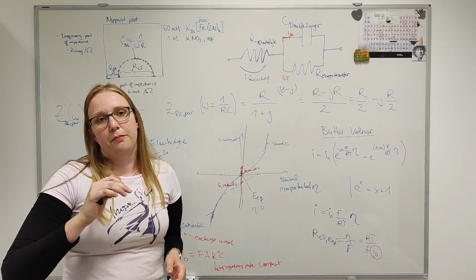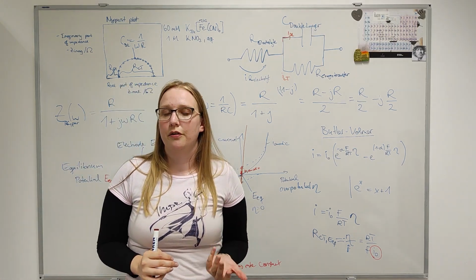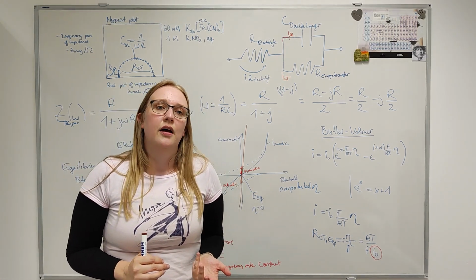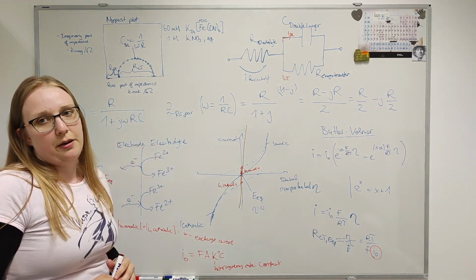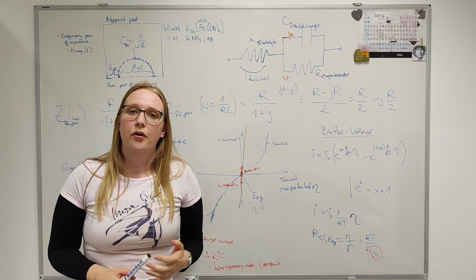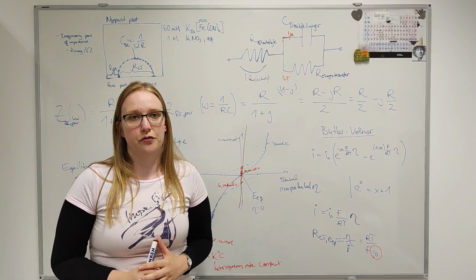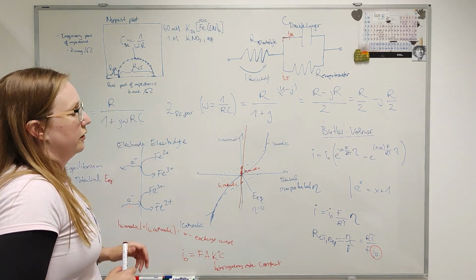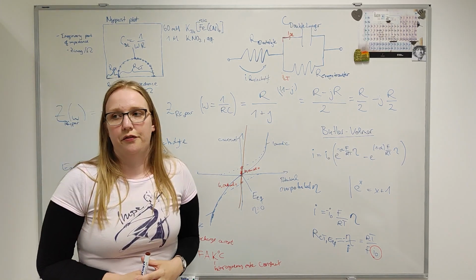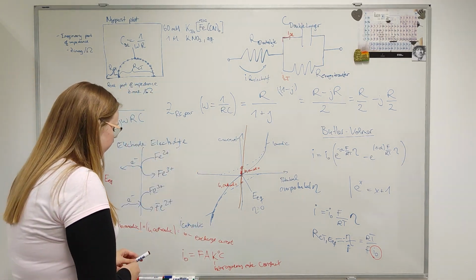So that means from this part of the cyclic voltammogram where the current is rising with the potential before the peak, you cannot estimate any kinetics. But with our electrochemical impedance experiment, we were able to measure easily in such high frequency ranges that we could separate those processes and have, for this very fast kinetics, even quite well separated from the mass transfer behavior, our semicircle we can easily describe.